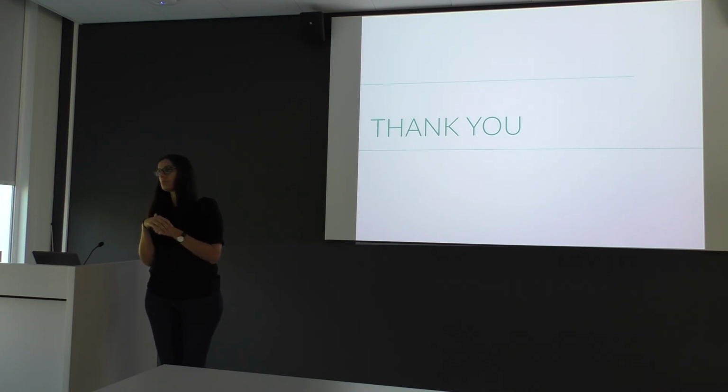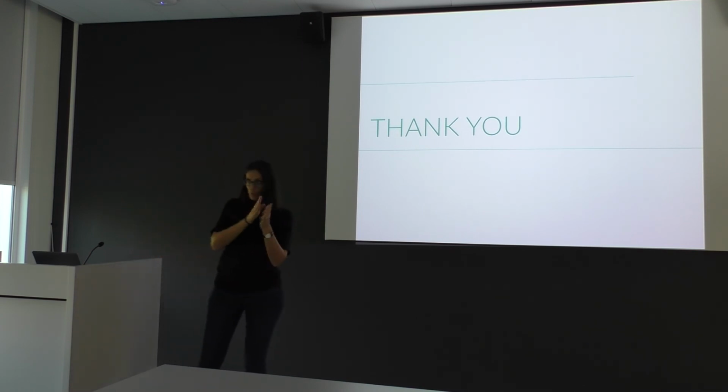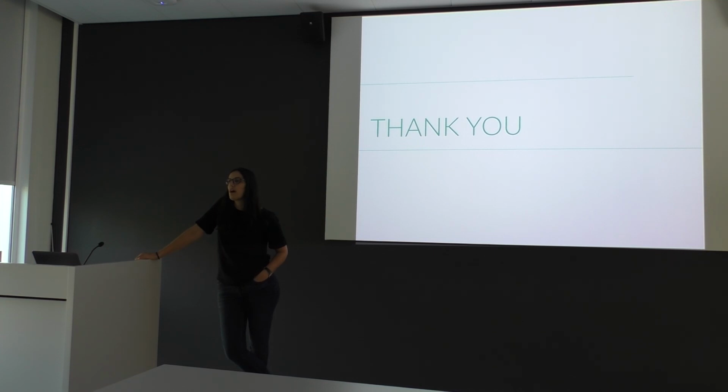Right. But everything I showed you is literally after that. We did not tweak or change anything. The unit would not even be allowed to do that. I could imagine that there are certain hysteresis steps, if you go from one illumination to another. This we avoid. This was actually a problem with the ice thickness measurement. Before, we did not use the trick with the energy filter in, energy filter out, because normally you would have to go to a magnification that is too low, so that you go out of the LM mode. But now you can work around it, so now we use it.